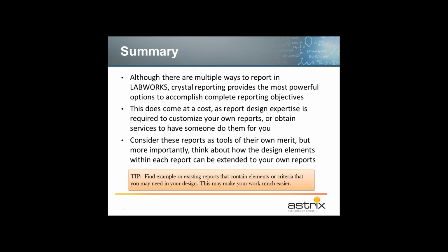But here really in summary, although there are multiple ways to report in LabWorks, Crystal provides the most powerful options to accomplish your complete reporting objectives. This does come at a cost. As you can see here, report design expertise is required to customize your own reports, or you can obtain services to have someone do them for you if you don't have the expertise in-house. And as I mentioned earlier, consider these reports as tools of their own merit, but more importantly, think about how the design elements within each of these reports can be extended to whatever you may want in your laboratory.